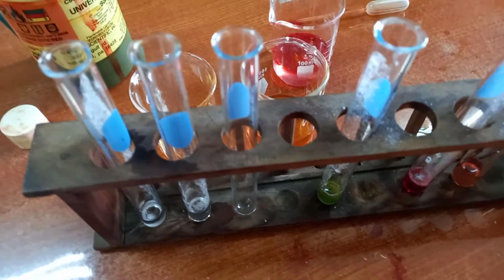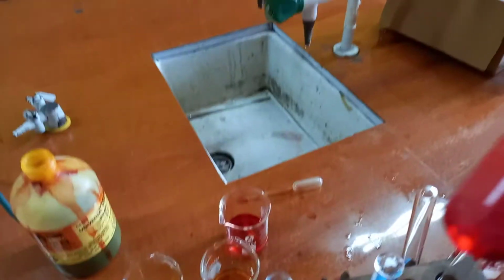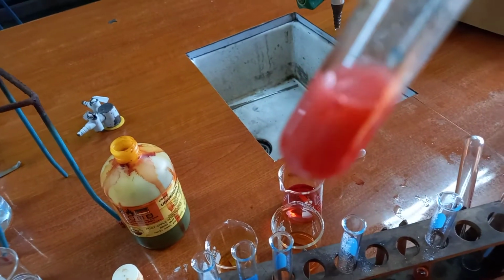So let's add some more sodium carbonate. Alright, so let's add some more. So you can see it reacting vigorously as well.